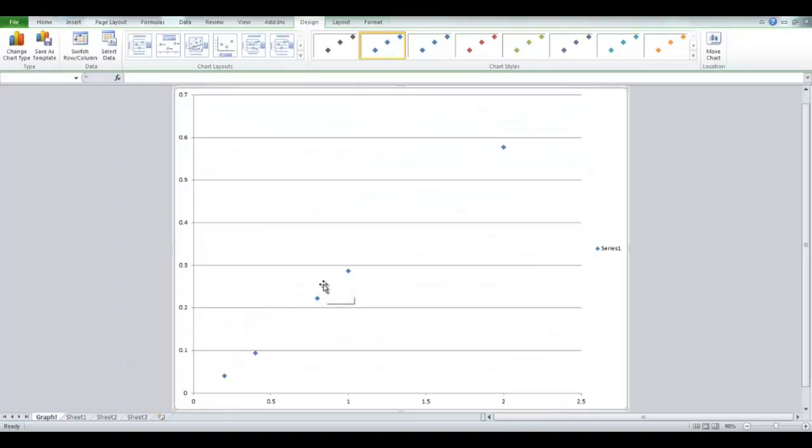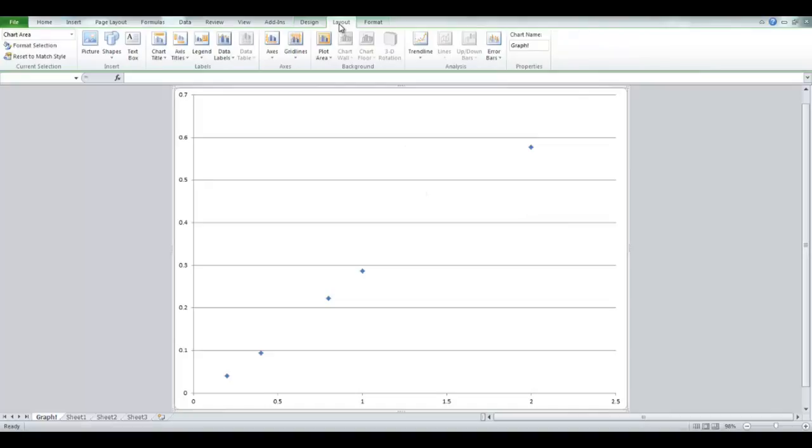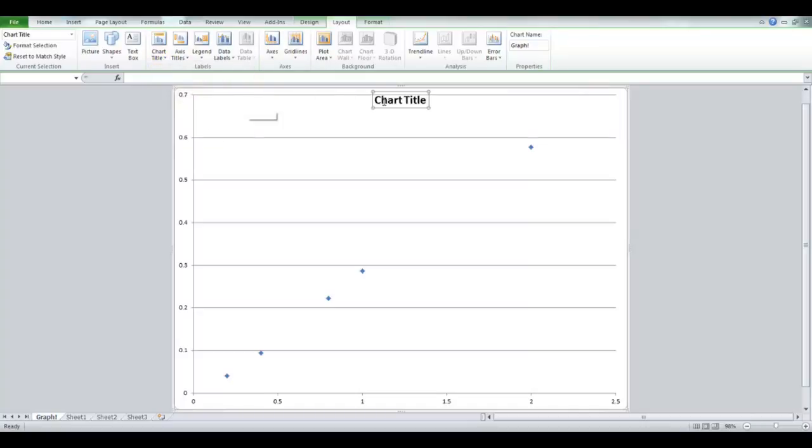So, let's customize it. First thing you want to do is get rid of the legend. Simply left click and backspace. Next you want to go up to Layout, as you can see at the top, and have all your options. Let's start with the chart title. You can choose either of the two, Centered Overlay title or Above Chart. I choose this one, just so I can show you how to resize the graph should you need it.